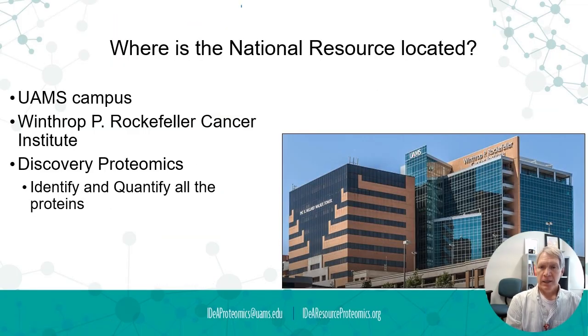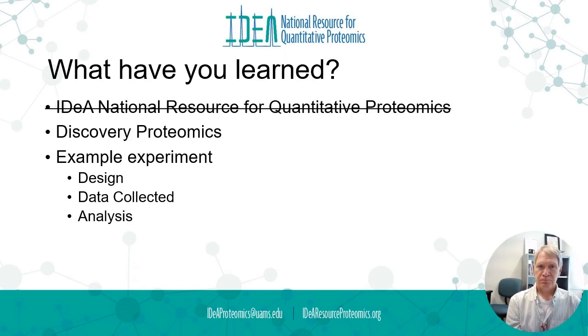We're located in the University of Arkansas for Medical Sciences campus in the Cancer Institute on the 9th floor, and that's in Little Rock, Arkansas. And we do discovery proteomics, which essentially means we try to identify and quantify all proteins in a sample.